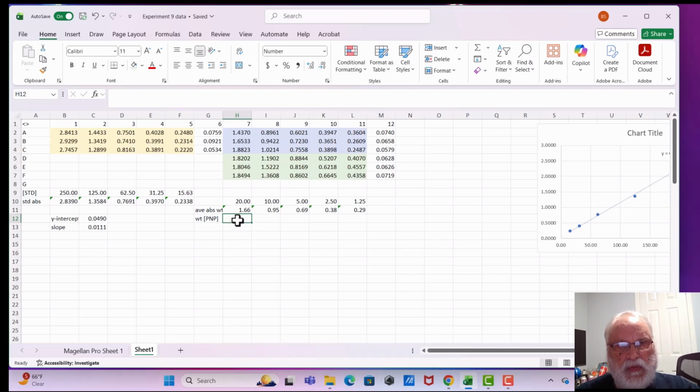Now, a couple people told me that some versions of Excel, you actually have to put more parentheses in it. So if you get values that look really unusual, you might need to do it. Just remember that Excel uses the PEMDAS thing where it does parentheses, exponents, division, multiplication at the same time, and addition and subtraction at the same time.